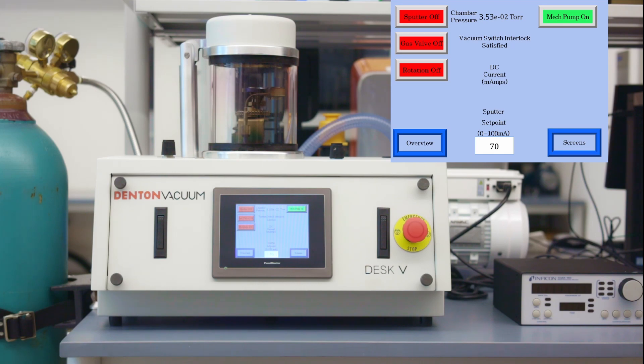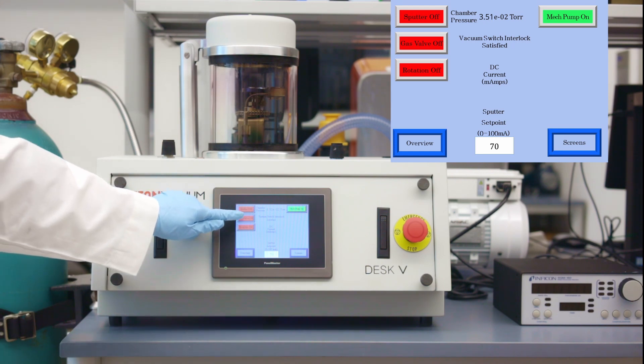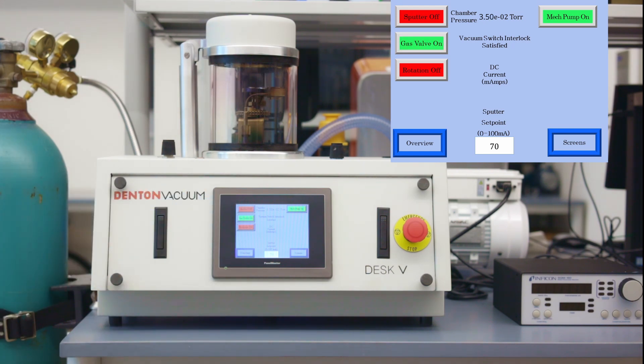Once the pressure drops to 0.03 torr or 3 times 10 to the power negative 2 torr, tap on gas valve. Wait until the pressure drops to 0.03 torr.